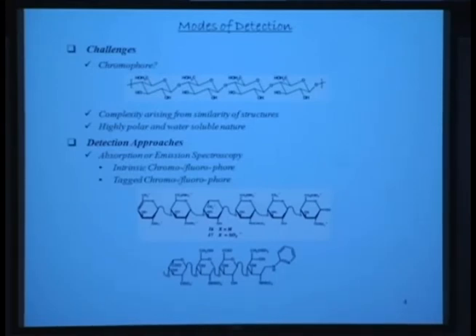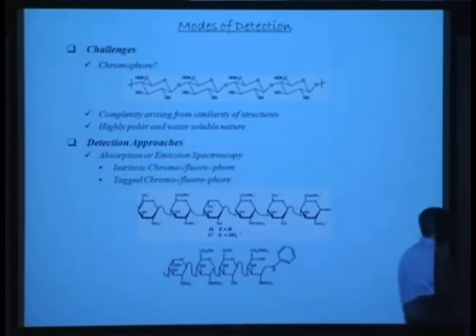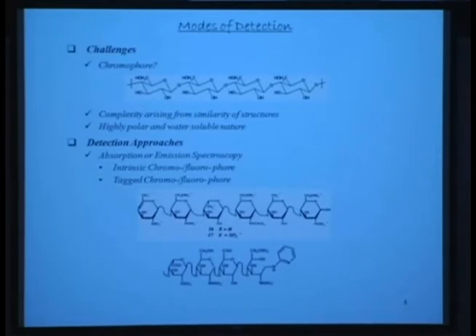Or any version of this. So this is always in equilibrium with what we discussed yesterday, right? And that aldehyde is the reactive functional group. So it is typically reacted with molecules that in essence have structures of this sort. For the most part, you can do it with any amine, but if you really want to ease the detection, then you use some kind of a conjugated amine, and there are a large number of groups.